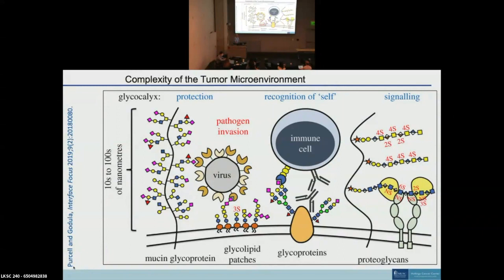And so our attempts, we're kind of on the front end of where you can go. That's why the enzyme part is very critical, because at least there are some tools there. Most of the time it's reductive. We're just getting rid of something or chopping it down so we can detect it in the right mass range. And unfortunately, the PNGase F for N-linked glycans has been around a while, and it's really specific for these. Is this a pointer?